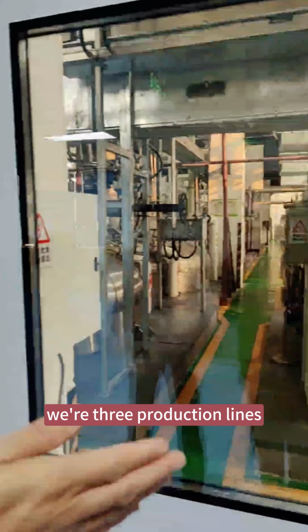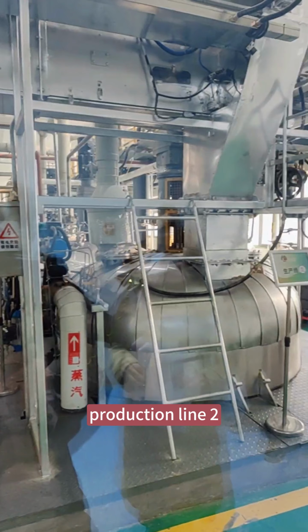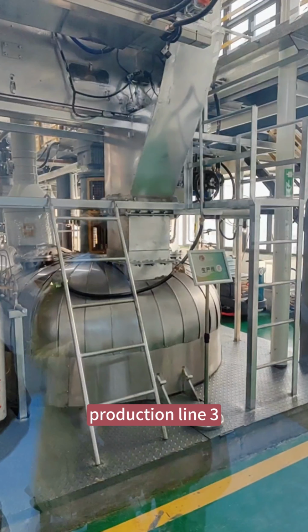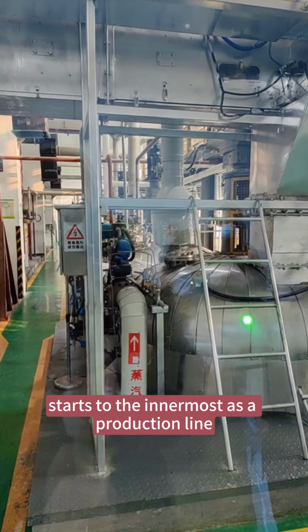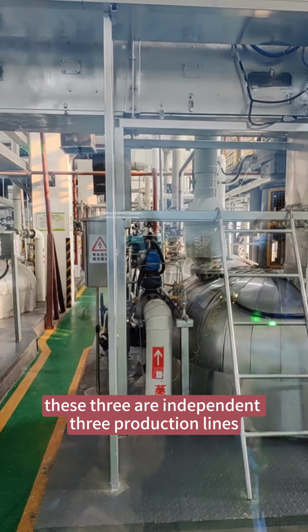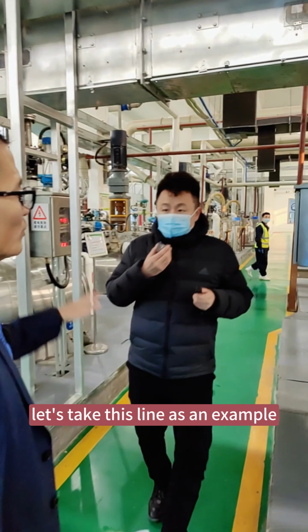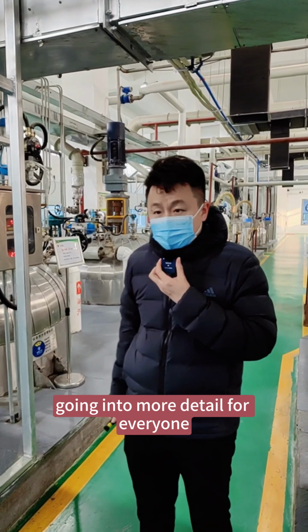There were three production lines: production line 1, production line 2, and production line 3. Each of these lines is independent. This one reactor starts from the innermost as a production line. These three are independent production lines. Let's take this line as an example and go into more detail for everyone.